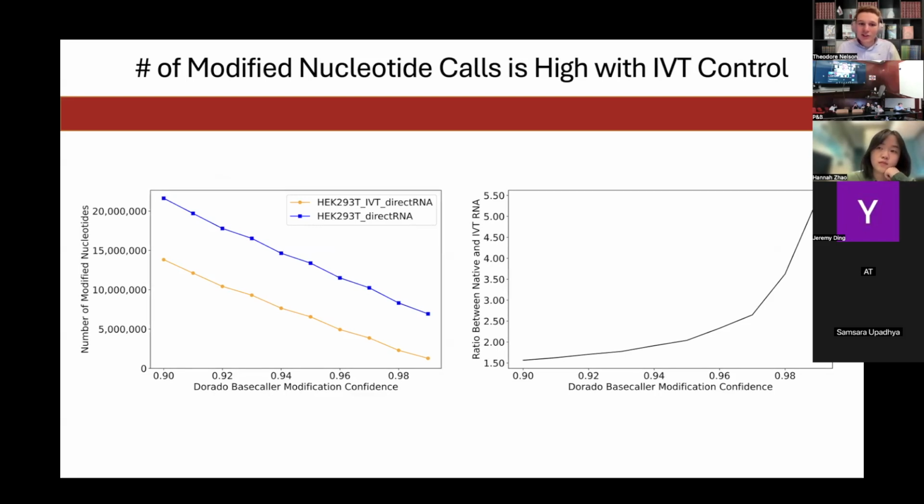So if you're looking for stoichiometries less than 10%, you're going to get a lot of noise. Depending on your coverage cutoff for a particular site, if you were looking at, for example, 20 reads as a coverage cutoff, with only 2 reads off you've basically got a new site that's going to appear in your final readout. So again, coverage at each site is important to calling these things.